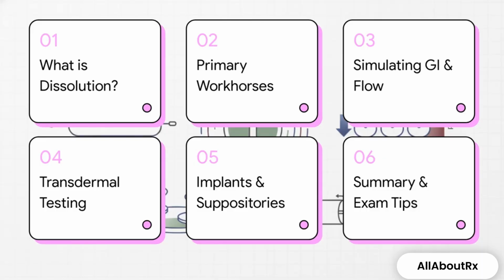Okay, let's get into it. Here is the quick roadmap for our explainer today. 1. What is dissolution? 2. The primary workhorses. 3. Simulating GI and flow. 4. Transdermal testing. 5. Implants and suppositories. And finally, 6. Summary and exam tips.